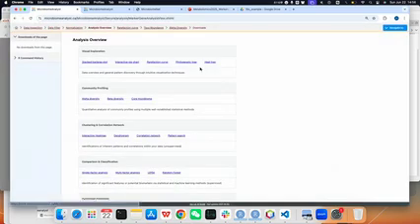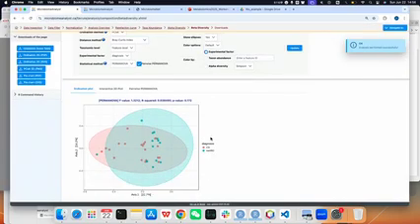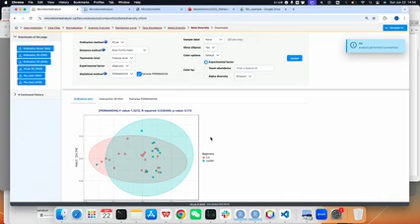And then we go to the beta diversity. This is the overall pattern to see if these two groups are different. As we can see here, they have a lot of overlap. We provide different methods like PCoA, PCA, and NMDS, and distance.